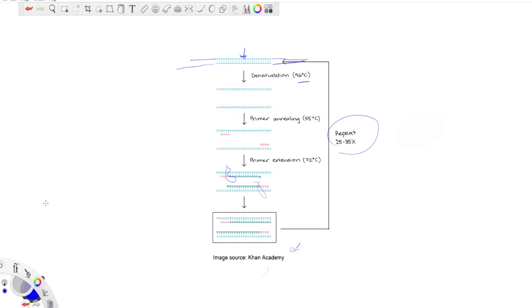And of course, this is a very important process in molecular biology because it allows us to study a specific gene, to amplify it, to study the expression, and the role and the importance of this is just countless. But I really hope that you learned at least something new from this small video, and thank you very much.